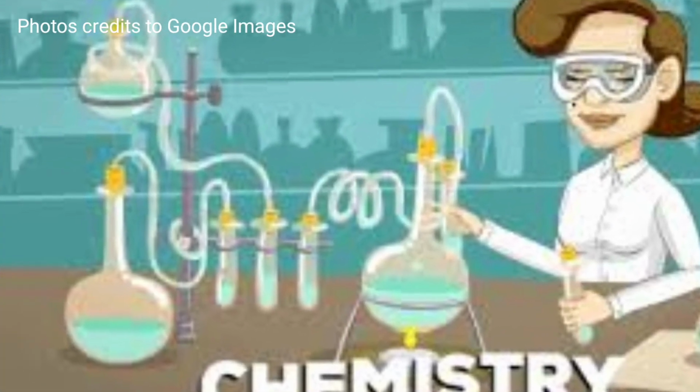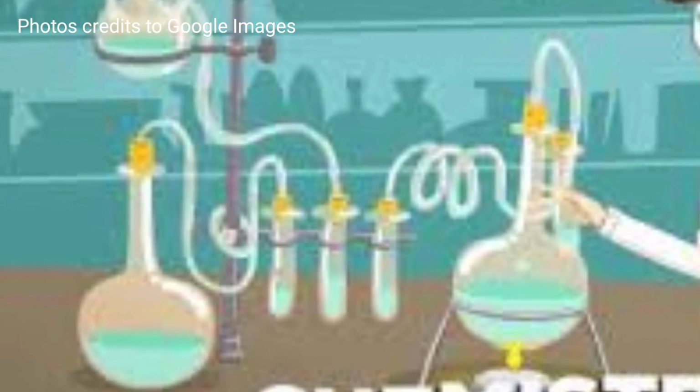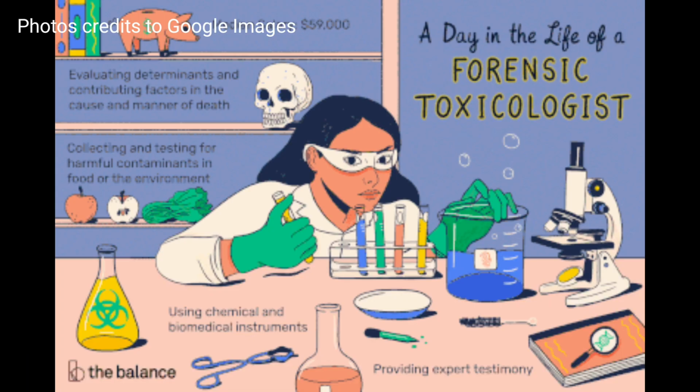Science can be both entertaining and risky at the same time. You can do a lot of harm if you don't know how to use chemicals and laboratory equipment properly. Though curiosity is a good thing, you should always have all the necessary information about lab chemicals before using them.